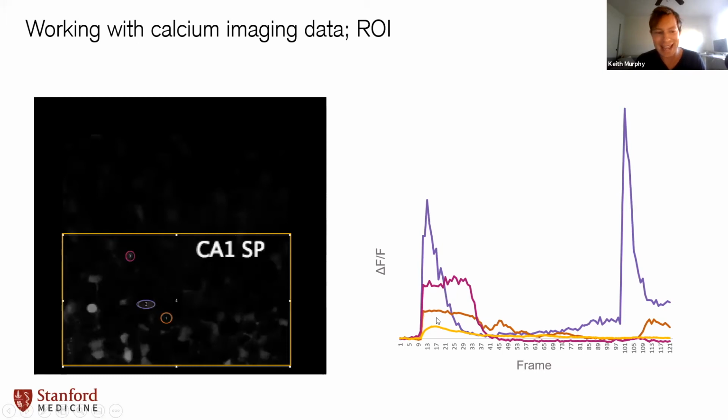But indeed, as I hypothesized, it's a fun science term, these cells have different magnitudes of response, and even a couple of them may have sort of this post-ultrasound response, although you may argue statistically that these are sort of stochastic events that are unrelated to the frame when our stimulation comes on.